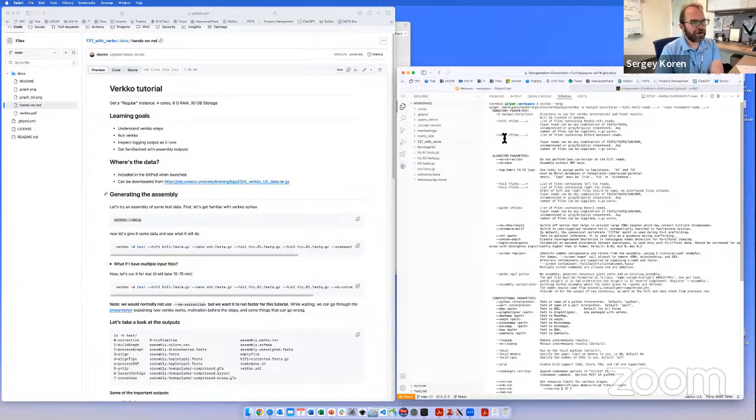And then nano are the nanopore data. The longer, the better. We typically recommend having a good amount of coverage in the ultra long data of reads greater than 100 kilobase, because this is really key to resolving some of the complex repeats in the genome.